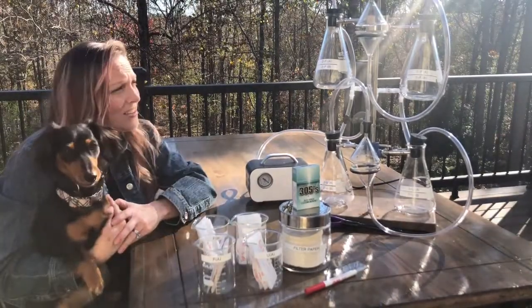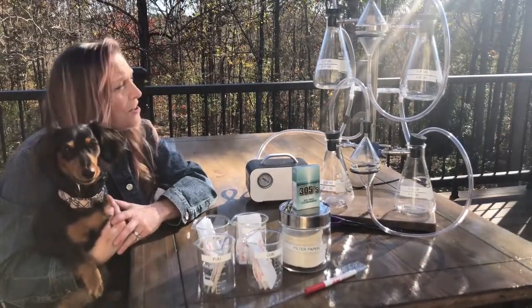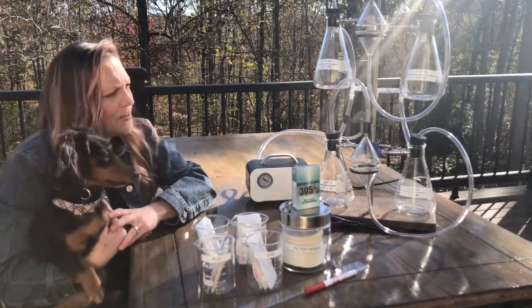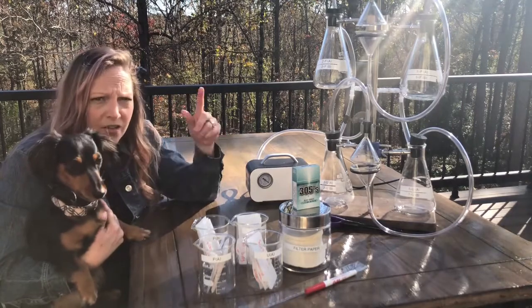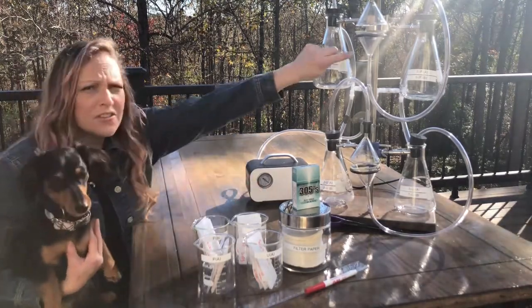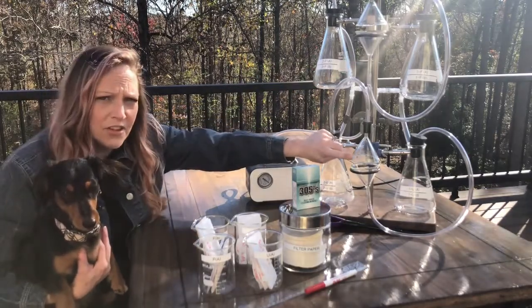So I wanted to make sure you guys got to see it and see it working, so I'm going to hope that the wind cooperates and it's not too windy. So an explanation of what we're doing today. We are going to do two trials, trial A and trial B. And what we're going to do is run a filtered cigarette up here and an unfiltered cigarette down here.